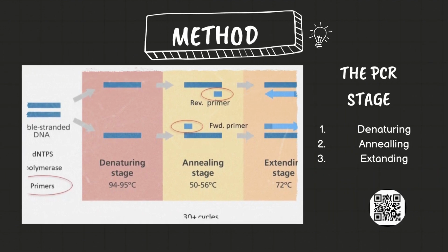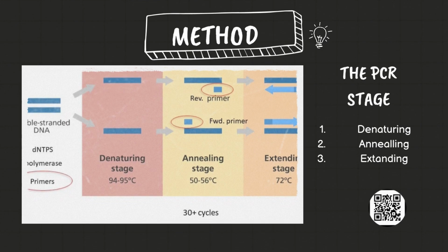The polymerase chain reaction is used in forensic analysis. A PCR process involves several steps that are crucial for amplifying specific segments of DNA. The first step in the PCR process is denaturation. Denaturation involves heating the double-stranded DNA template to separate it into two single strands. This process breaks the hydrogen bonds holding the DNA strands together for them to separate.